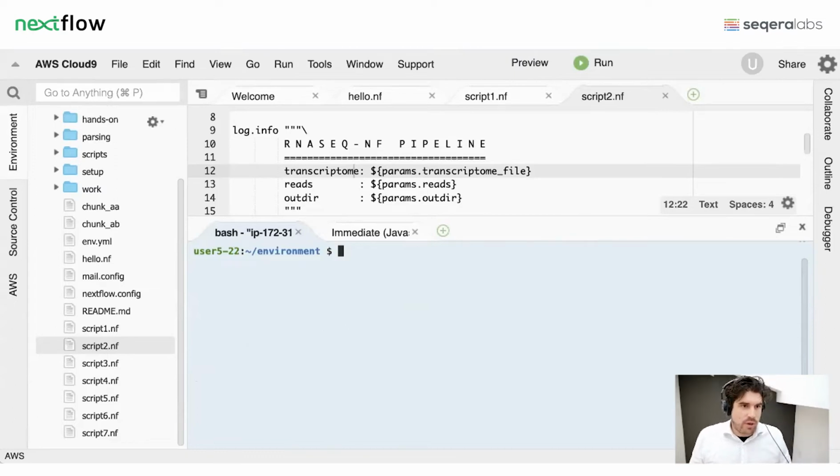What could you do? Well, maybe we could go download it. Maybe we could go install it. But that wouldn't be the best use of our time, particularly if you had to do that on every node of your cluster or some setup like that. So how can we get around this? This is when we can start to use containers with Nextflow and how we can start to use Docker. So for us, if we want to do that, we can simply say Nextflow run with Docker.